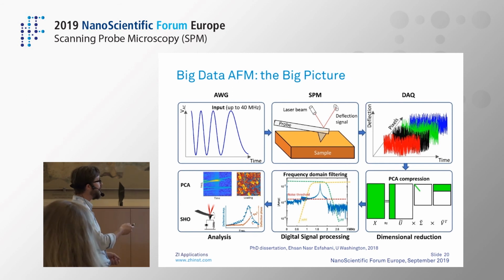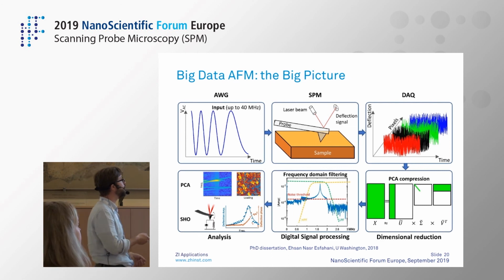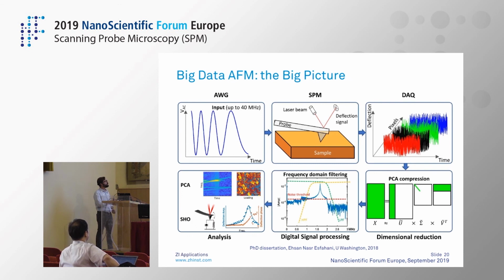Yeah. So once you have everything nicely triggered and all the data is aligned, then you can start to do some matrix diagonalization. Basically, you look at the different eigenmodes and find the principal component, or the one that has the biggest contribution. Then you can apply different filtering, or go back to a simple harmonic oscillator. Then of course you end up with many different images that you can get.